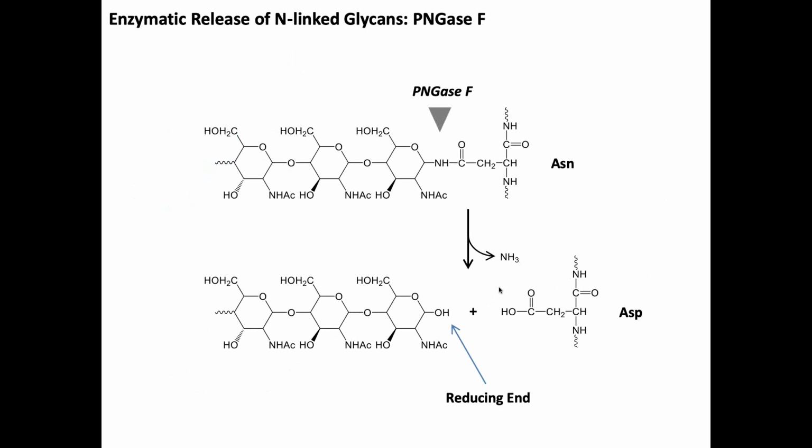It's a cost issue, and I don't know why it's that expensive. Somebody asked me in the proteomics course, and I don't know why. At this point, you think they could express it. But why would you use one enzyme versus the other if you're doing an experiment where, in the old days, for example, you're trying to find site localization of N-linked glycosylation, and you want to know where in my proteome N-linked glycosylation is occurring?